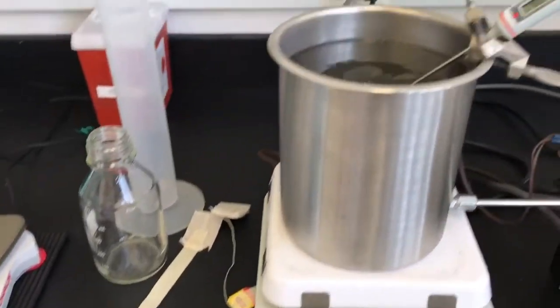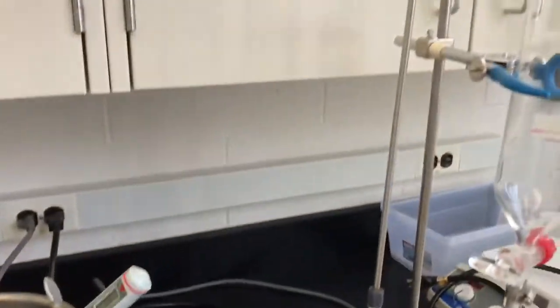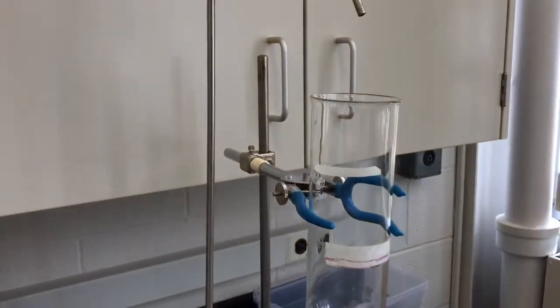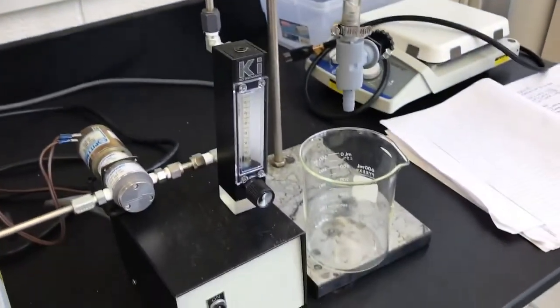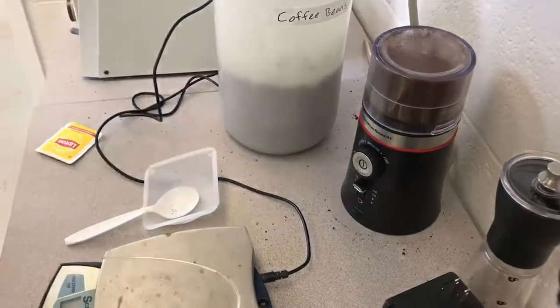Start off the experiment by heating your water to its desired value. Calibrate the flow meter for whatever flow rates that you choose to manipulate within the experiment. Now it's time to grind up some beans.